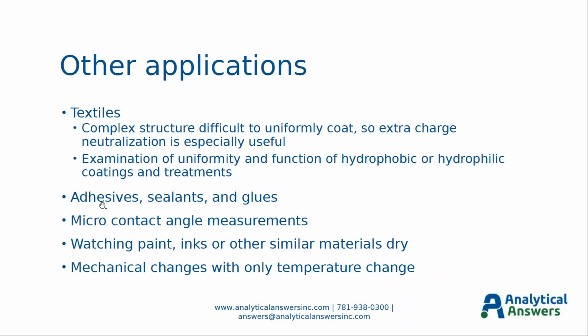You can also look at adhesives, sealants, and glues as they cure and dry. You can actually put little pieces of material together with adhesives and then watch the edges of the joints and see how the material behaves. If it's a water-activated adhesive or a sealant, then you can certainly watch the reaction occur.